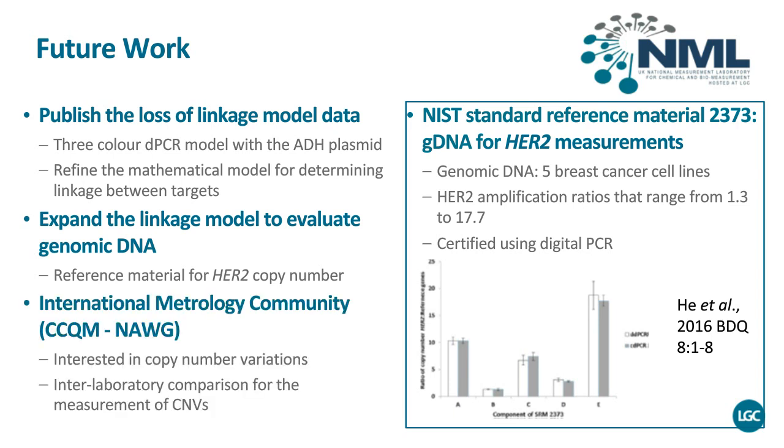Also, as part of the international metrology community, the CCQM, which is part of the BIPM, the Nucleic Acid Working Group. I'm very sorry, I've just thrown three acronyms at you. Essentially, these are the international metrology labs, and we all like to compare in order to start asking questions about traceability. We're looking at copy number variations in the interlab comparison for the measurement.